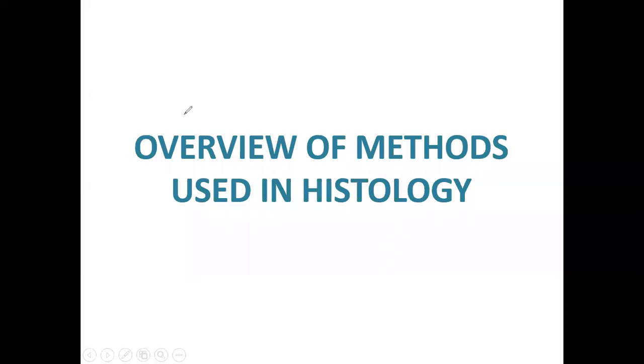Okay, so guys, our topic for this week is an overview of the methods used in histology. What are the different methods that we will be discussing? These include microscopy. So we will have a discussion of microscopy. Other than that, we have the preparation of tissues, where we will be talking about the different steps in preparing a tissue slide.